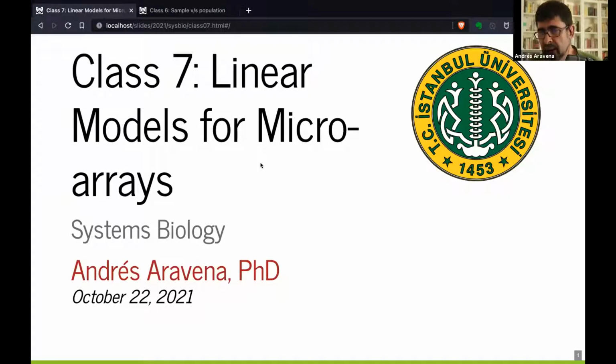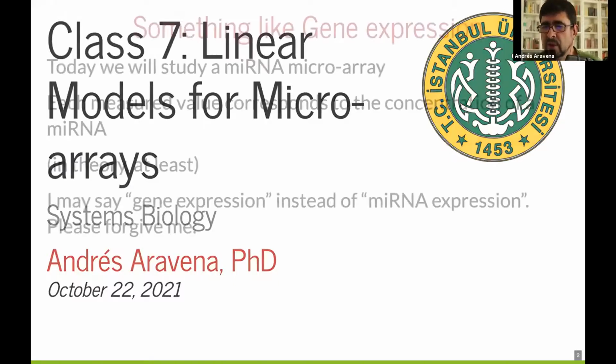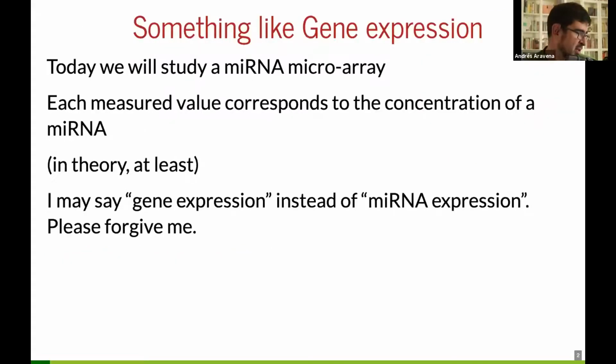Okay, now the class today, for the people who are online. I want to apply for a microarray analysis, and I will try to explain the best I can, given that the author of the experiment is not here. But basically, this is an experiment done by Atakan on the expression of microRNA.